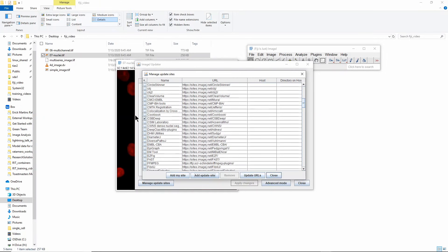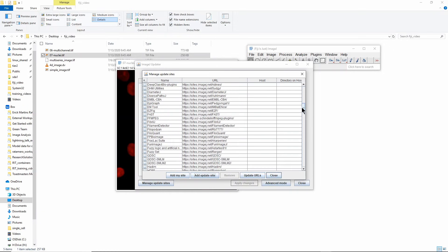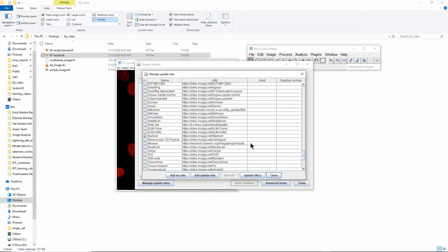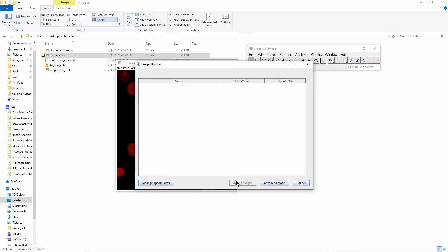To install StarDist what I did was I checked CSBDeep, which is a deep learning library from the CSBD in Dresden, and I checked StarDist. Close this and apply changes here and that's installed.